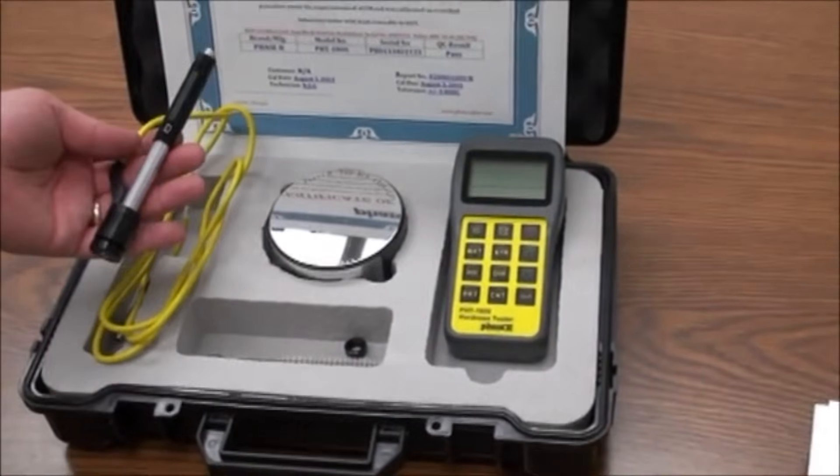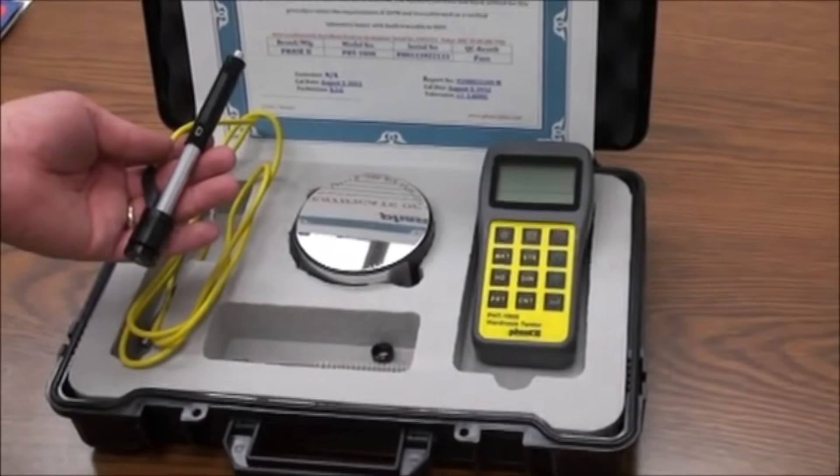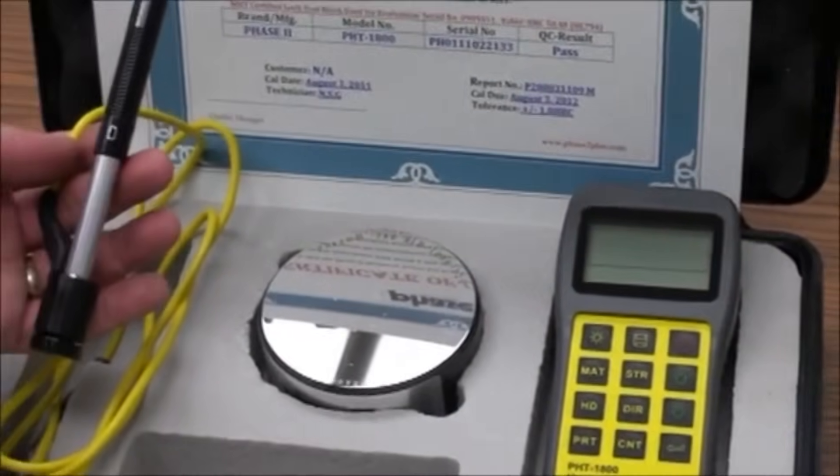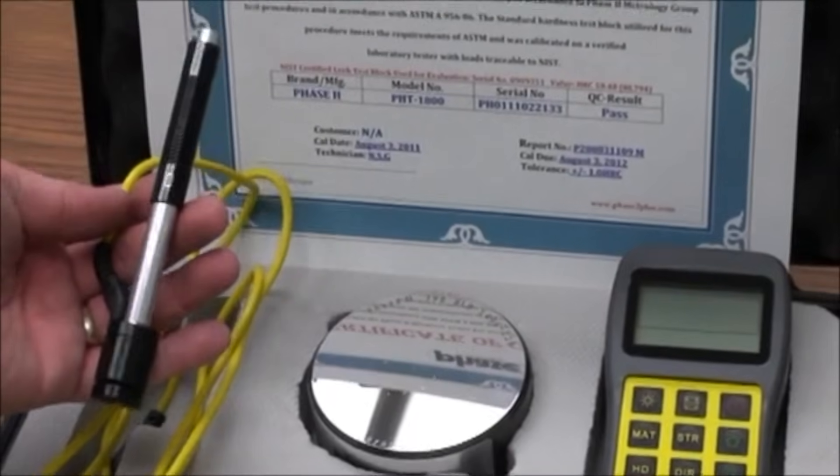The Phase 2 portable Lieb hardness testers have available the following probes for various applications. The D-Probe is a general purpose probe and comes standard on all models.